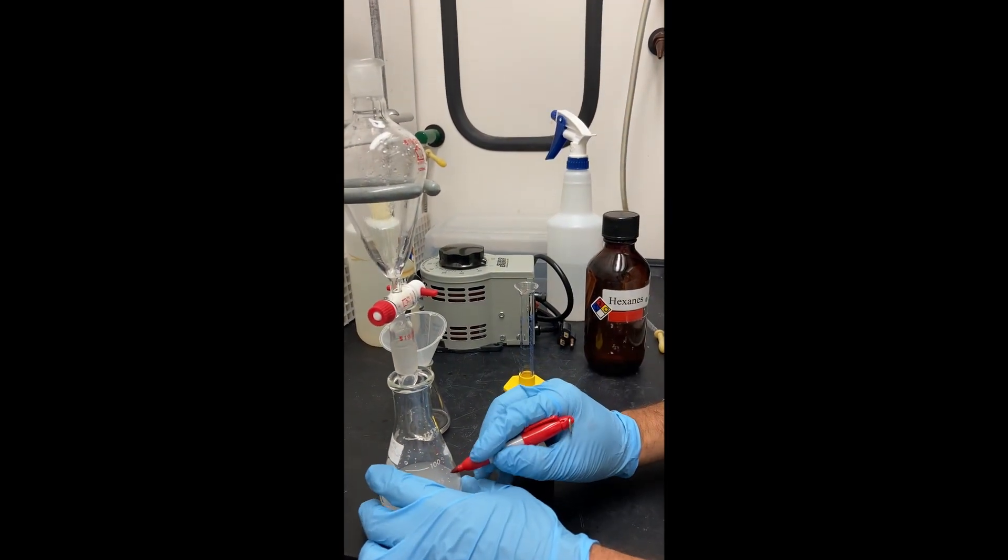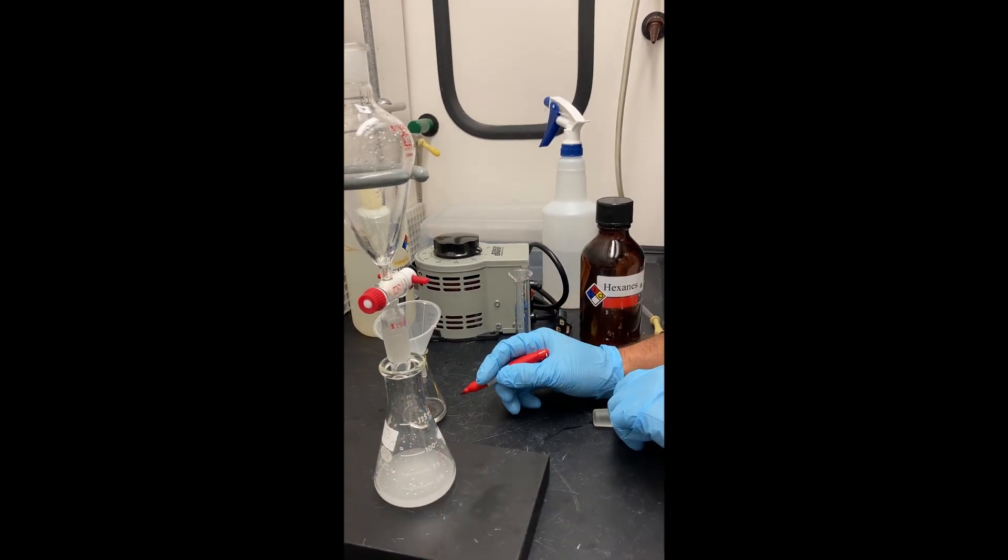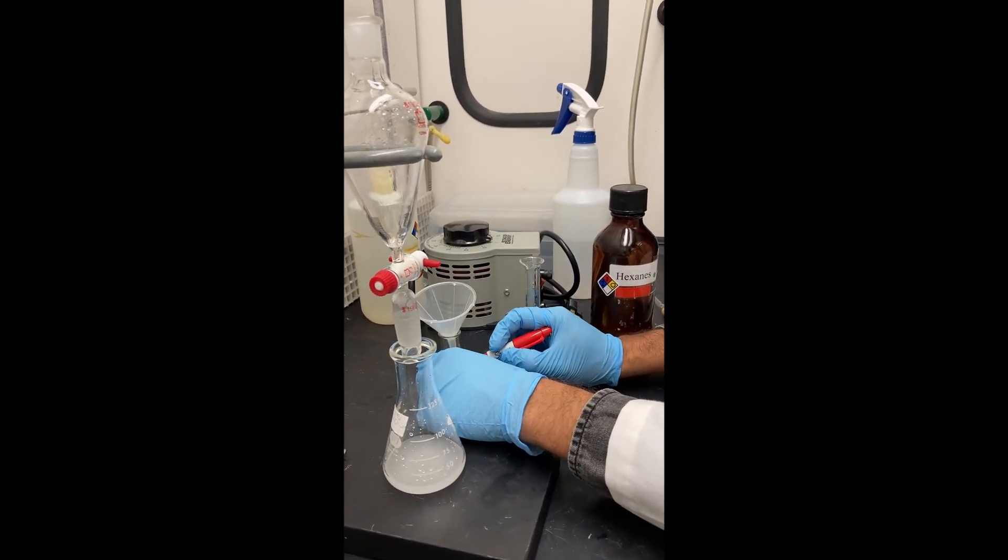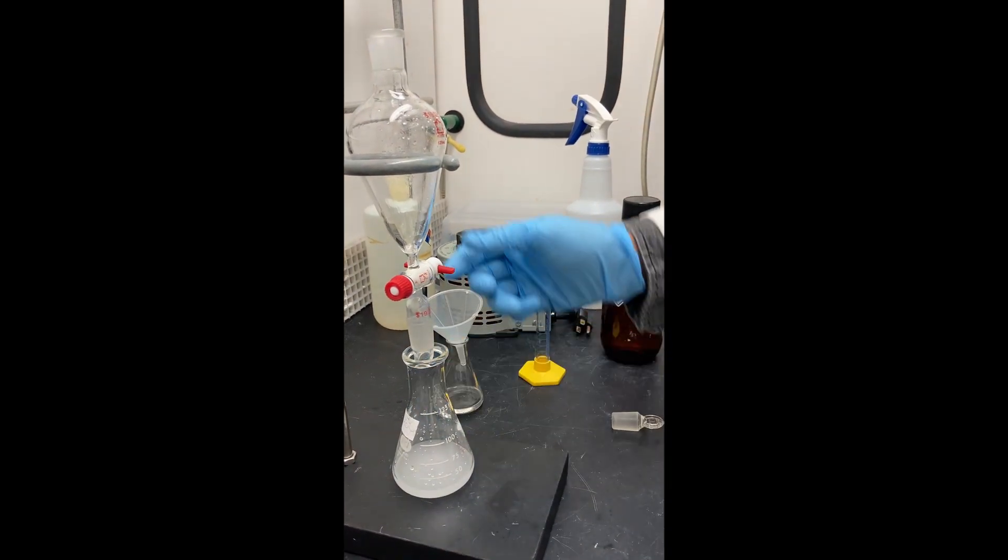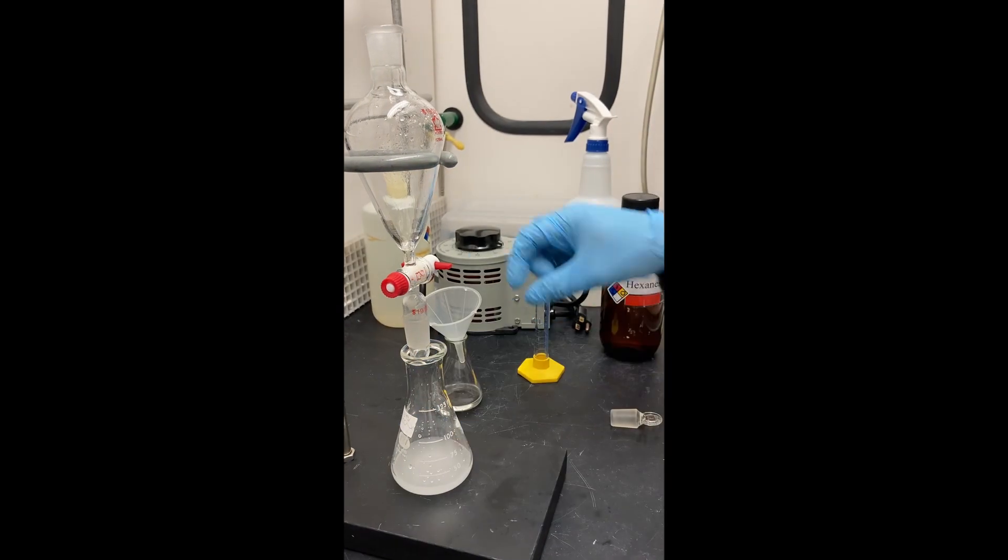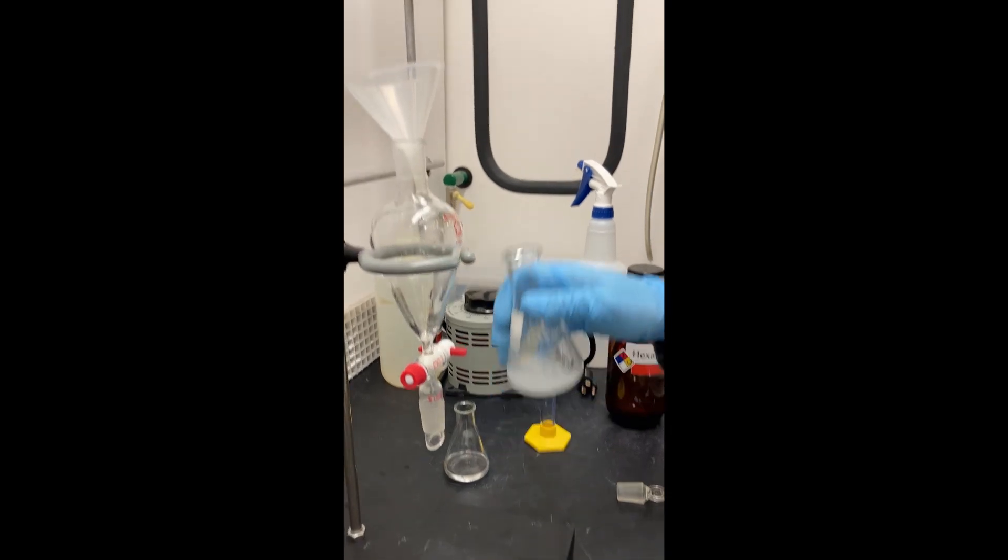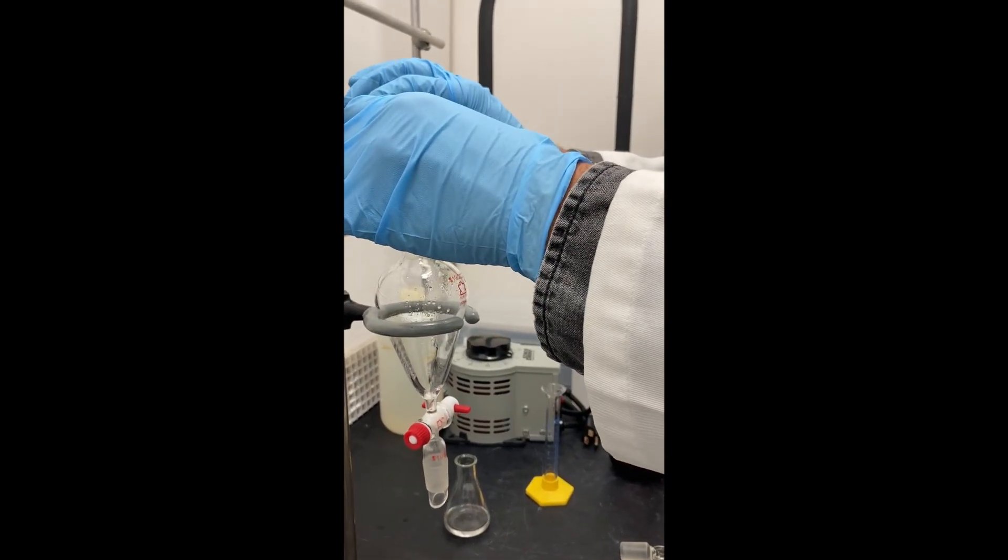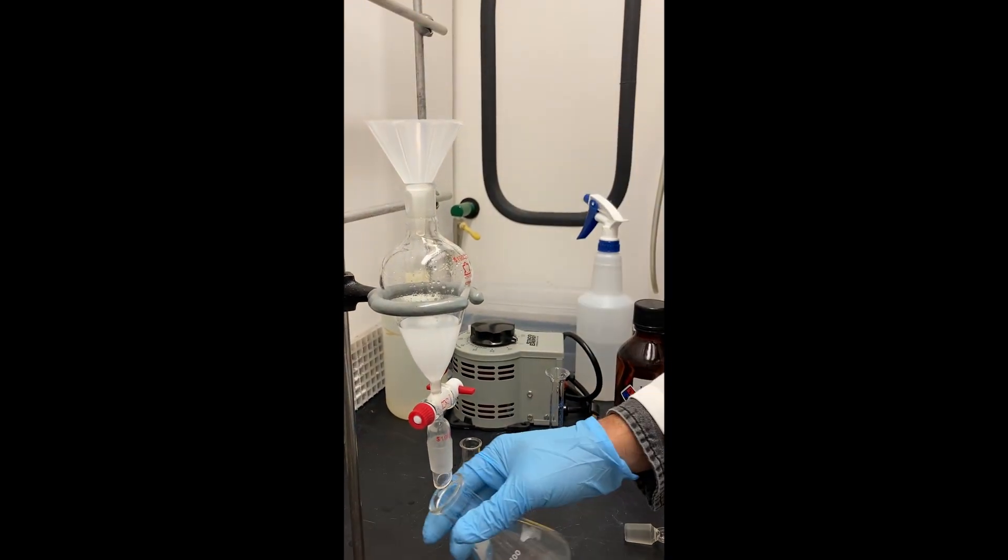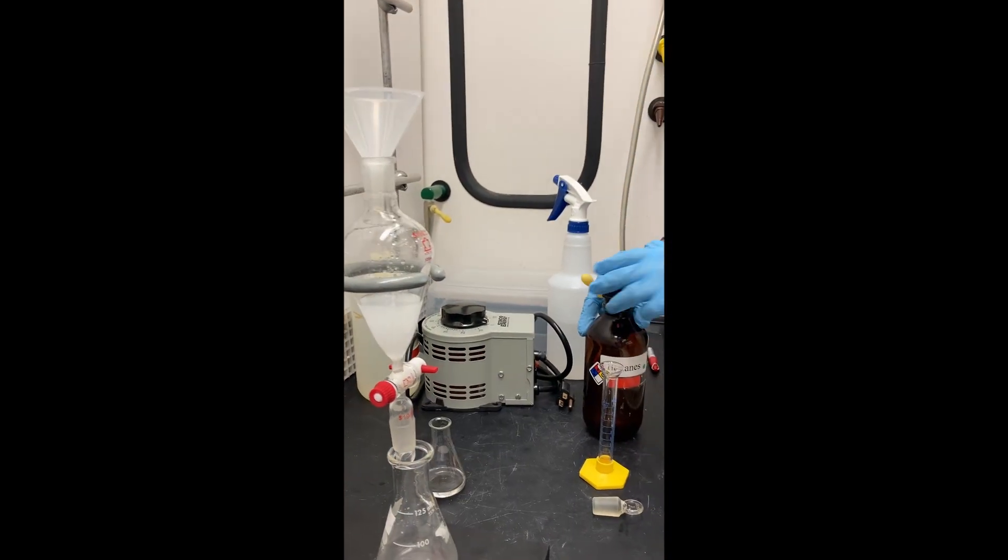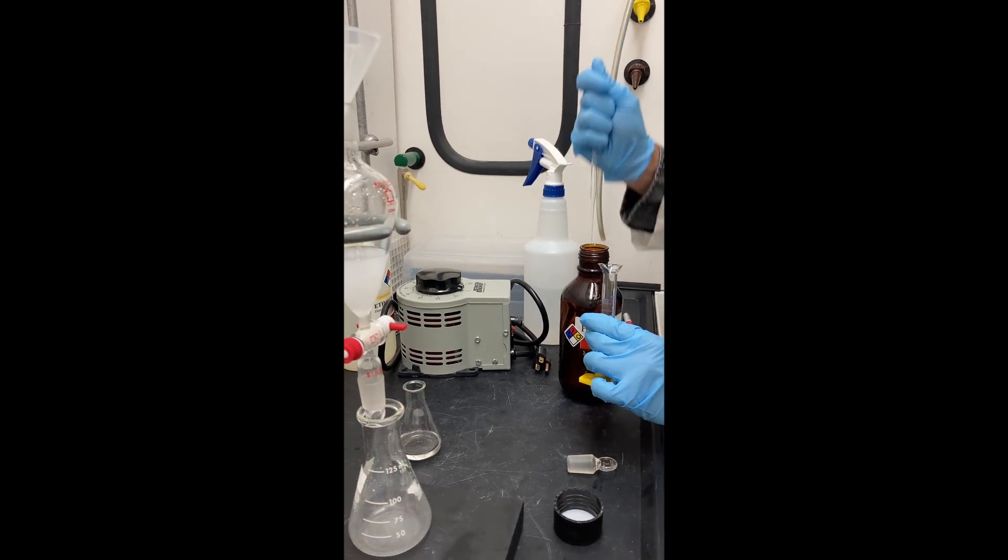During separations, labeling your glassware is highly recommended. Since there is still oil in the aqueous layer, we're going to want to extract from the aqueous layer a second time. You'll measure out another 10 milliliters of hexanes and then add that to the separatory funnel for your second extraction.